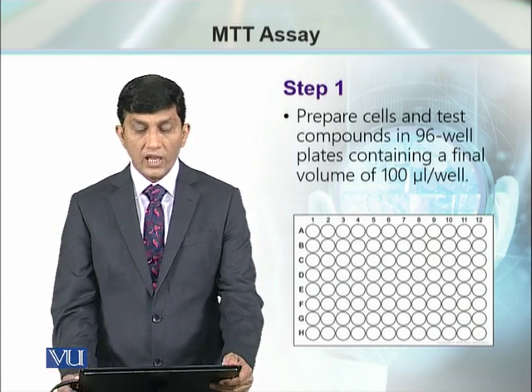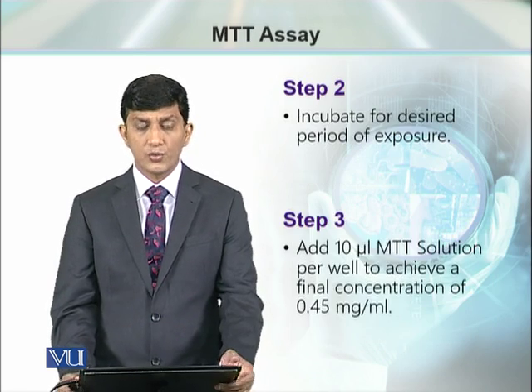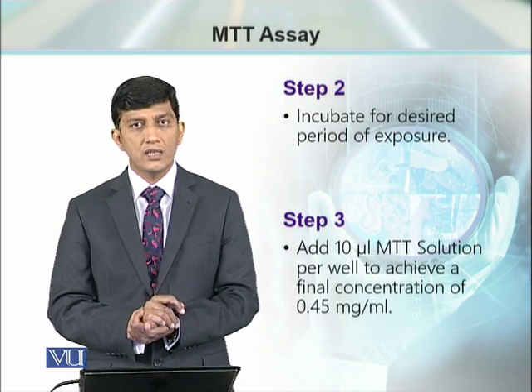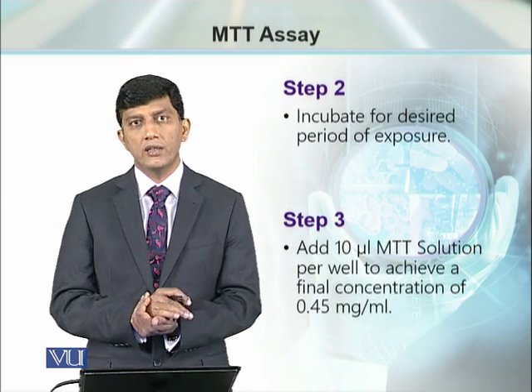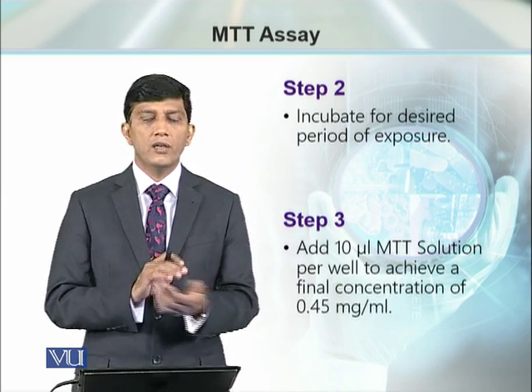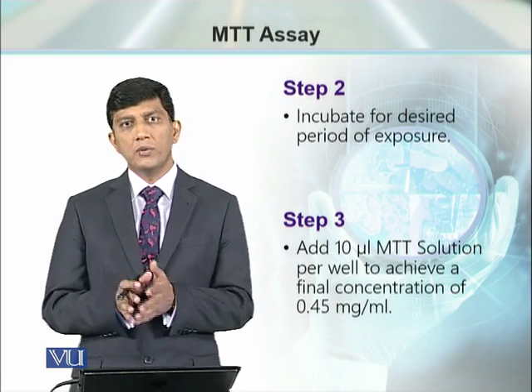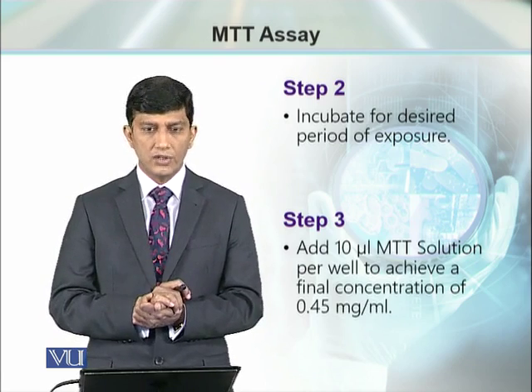Once we add the cells in this 96 well plate, we have to give it some time so that the cells can settle down, stick to the base of the well, and start the normal growth cycle. It can be overnight incubation, or 4 to 6 hours incubation. That you have to optimize and decide for your specific study.